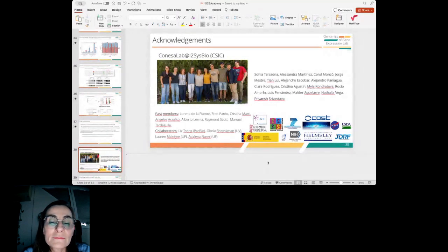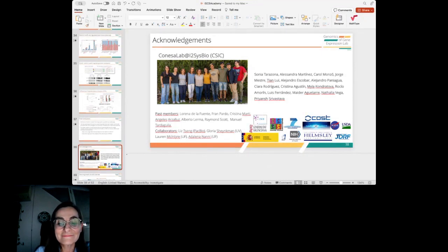Interesting. In the same vein, is there a specific transcription pipeline that you prefer working with? You mentioned PacBio and Nanopore, and was there one that was nicer, easier, or for whatever reason you liked more than the other ones? Okay, that's a tricky question, because in this long-read project, I was the jury. I was the evaluator. So I did not compete with my own pipeline, the ones that we are using in the lab, and that's of course the one I prefer, right?